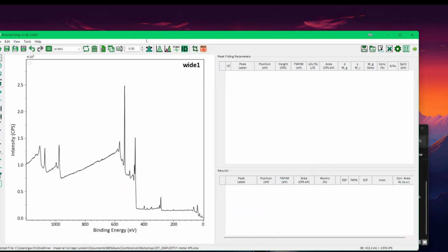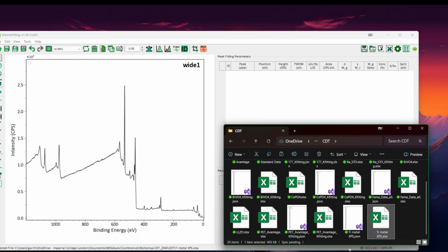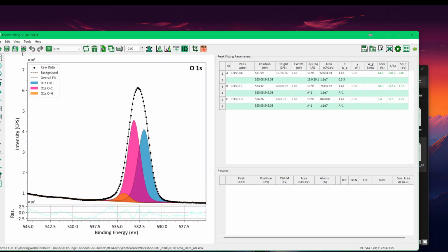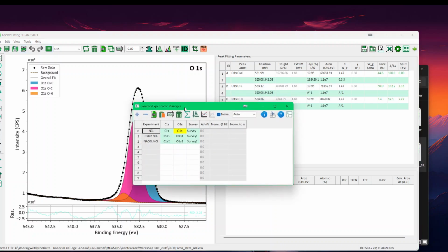The next bit I have done is, for example, if I go into another file, let me just find that. So something similar, and this is 3 files put together.